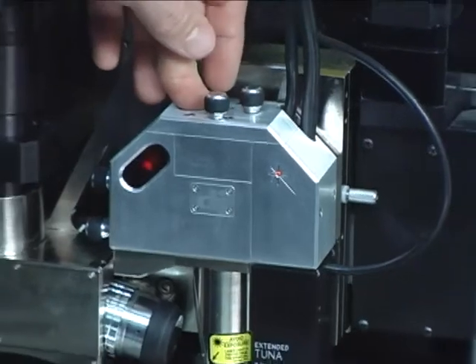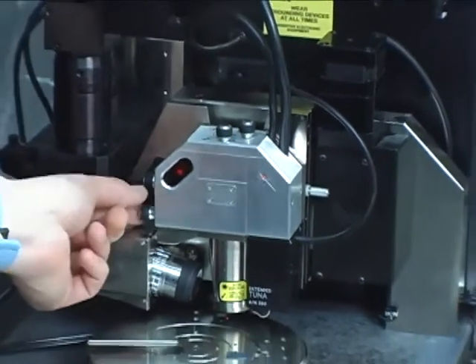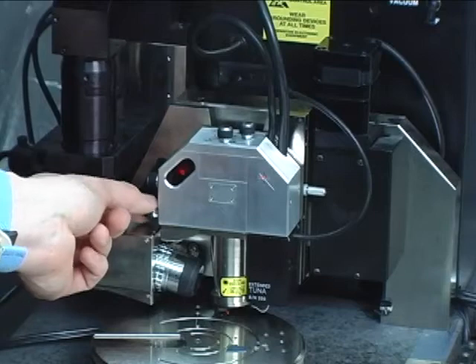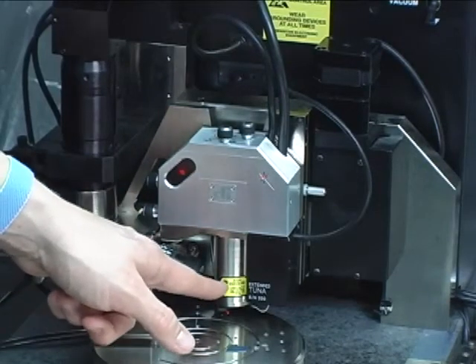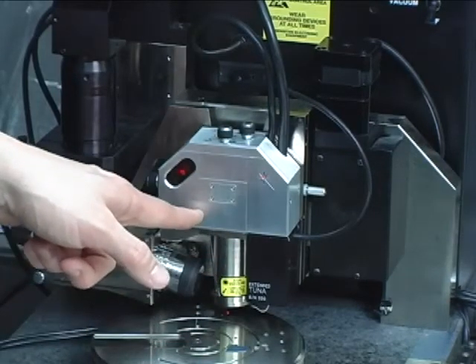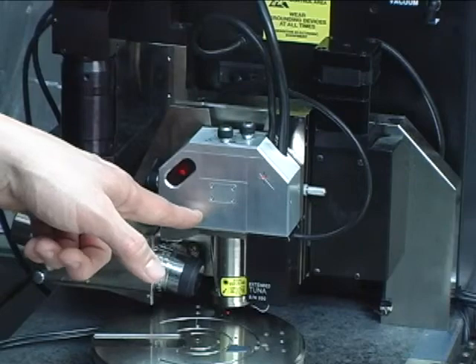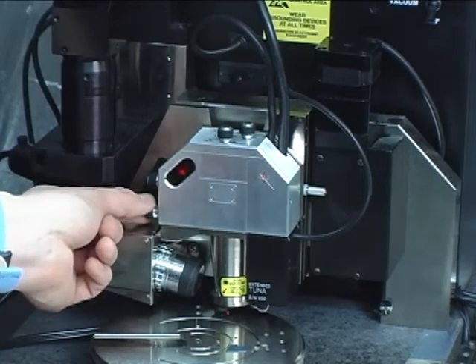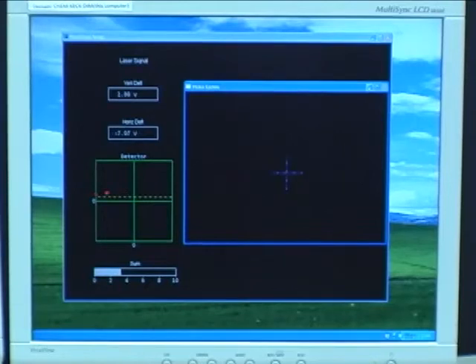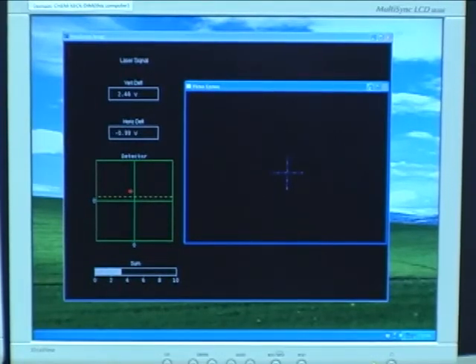We'll now adjust the reflection of the laser beam off the back of the cantilever so that it lines up with the detector. And we do that by adjusting these knobs on the left and observing the change in the signal from the detector on our screen.